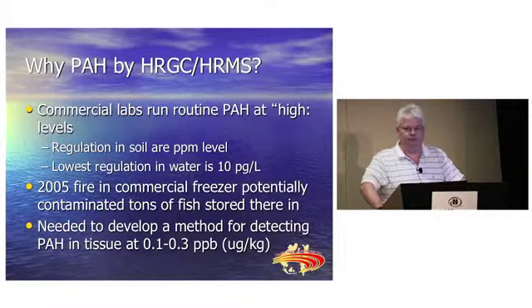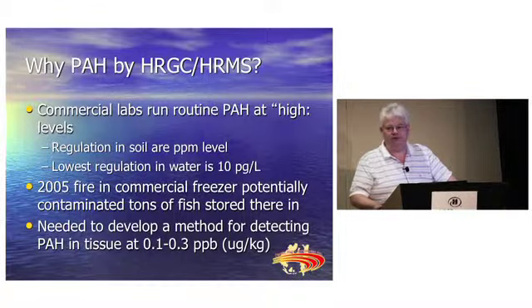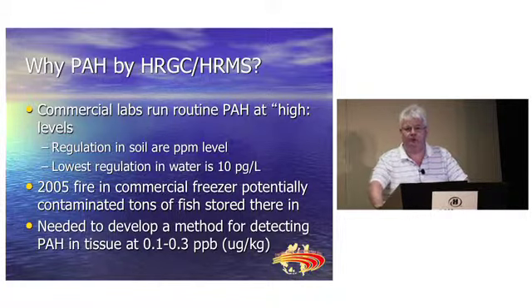Several of my competitor labs, all good quality labs, took some samples in and tested them and gave detection limits of 50 to 100 parts per billion, said nothing detected, and CFIA said, try again, this is no good. We need detection limits, sub part per billion, down around 0.2 parts per billion before we'll release any of this food.